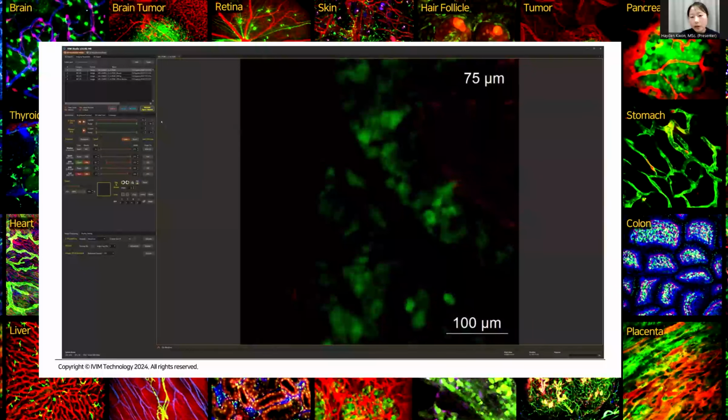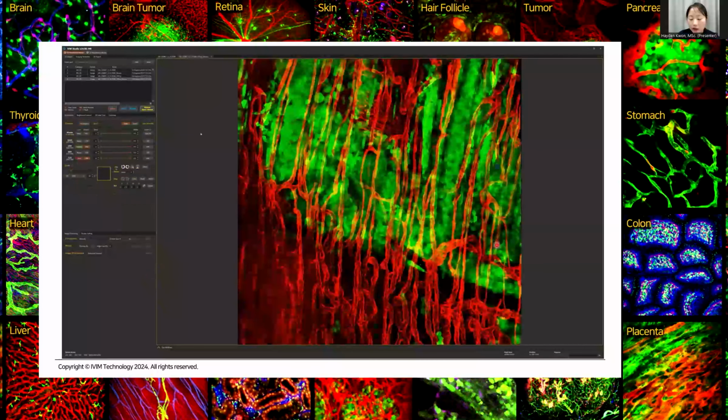Also, the Studio software has automatic stitching functions. The data with mosaic information has this activated execute key here. By clicking this key, all the separate individual images will be stitched together automatically.